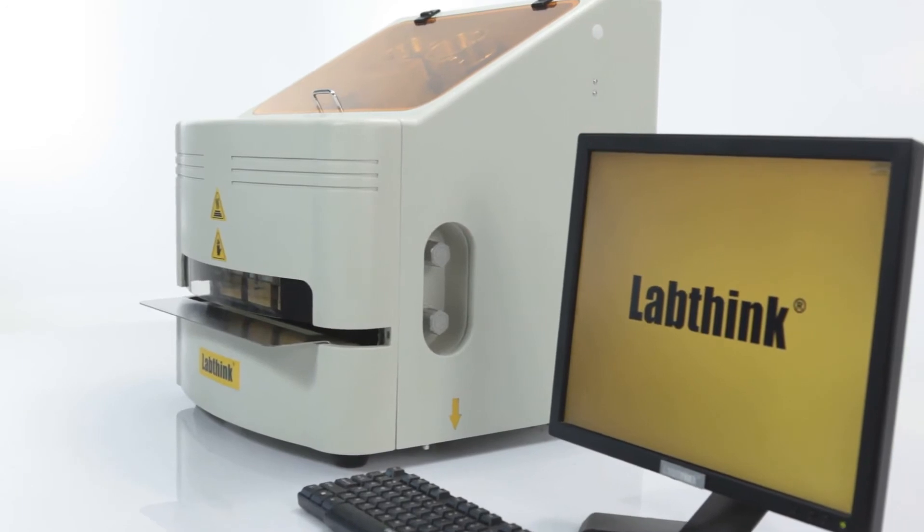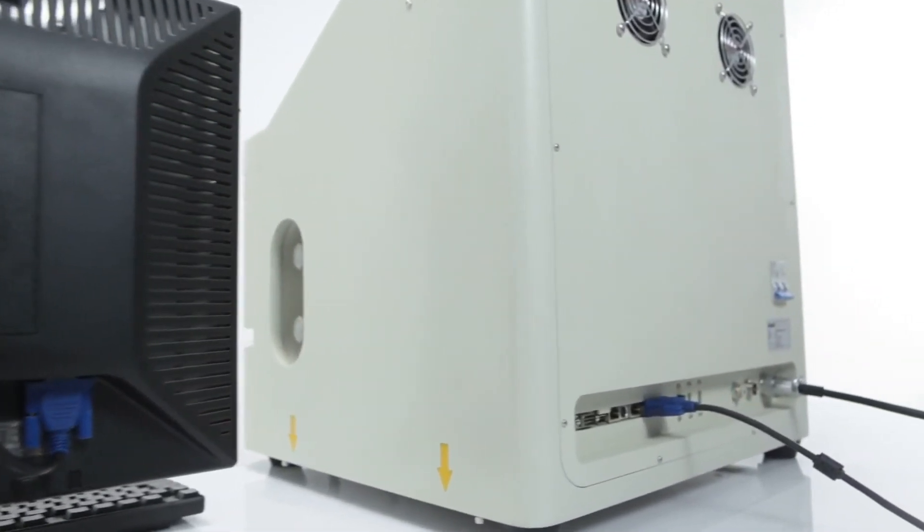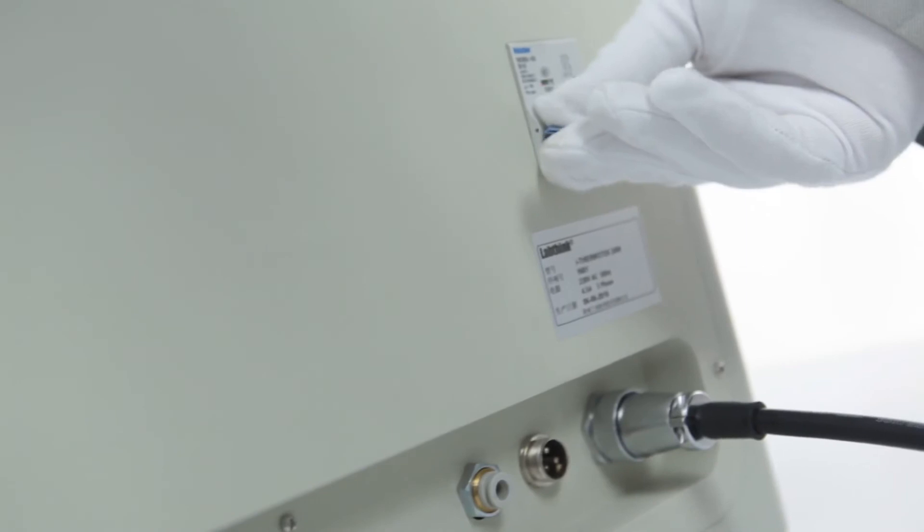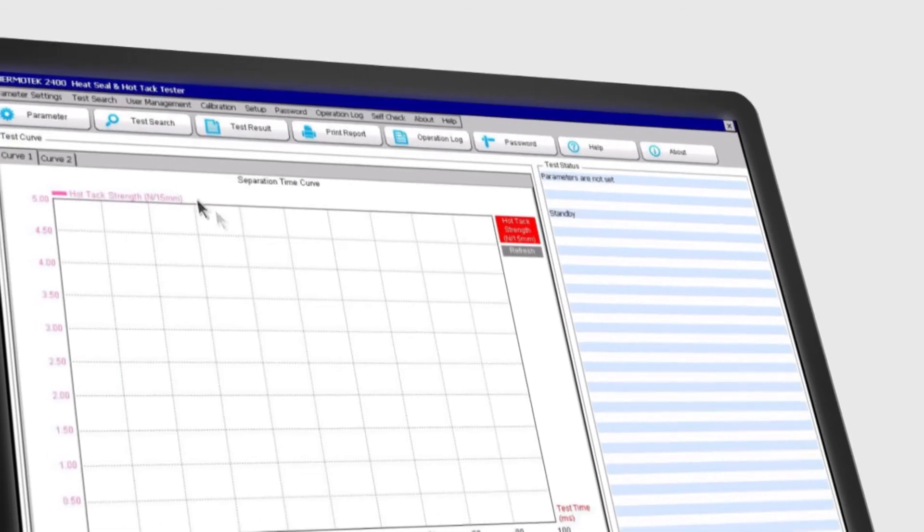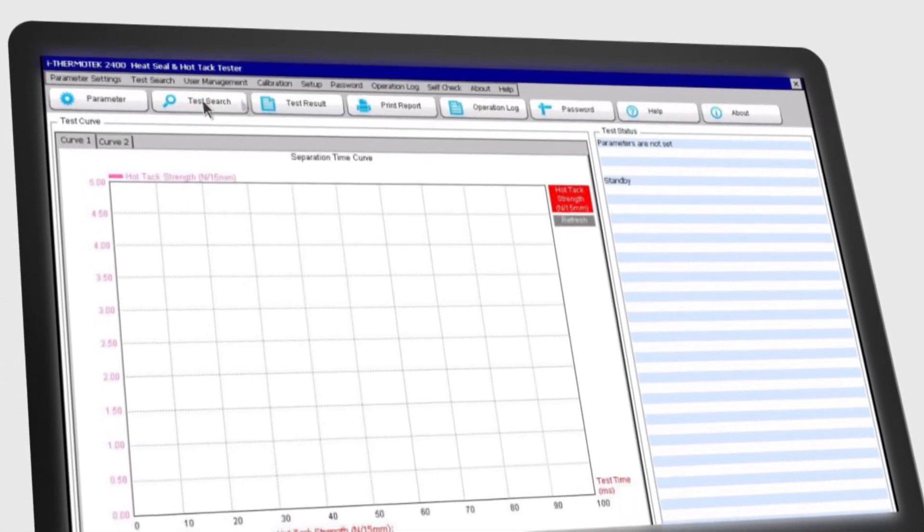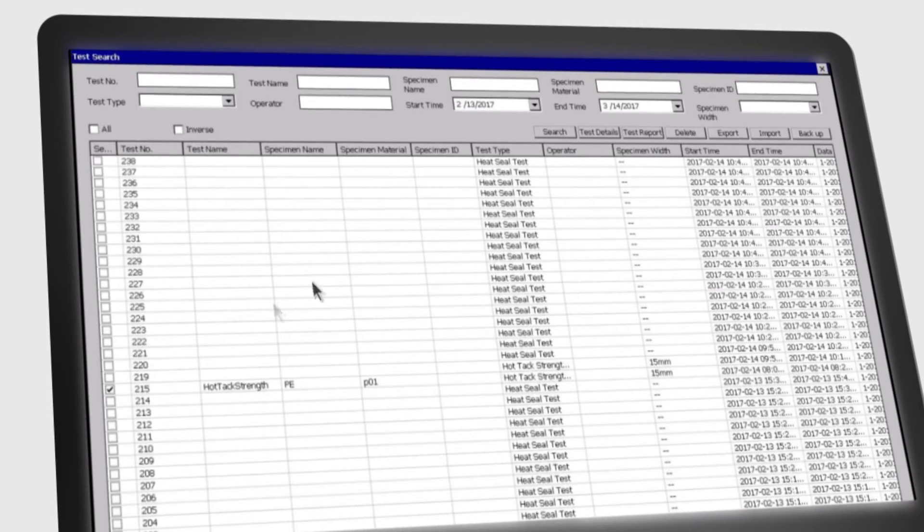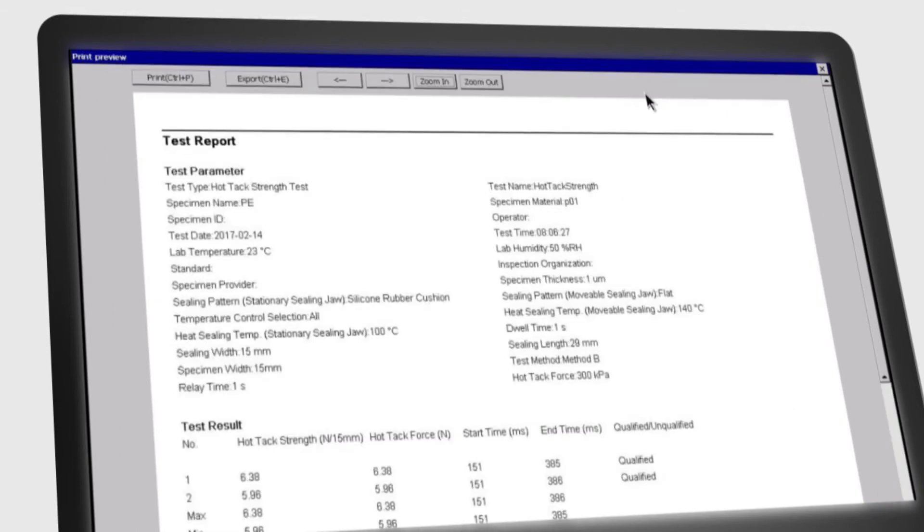i-Thermotech 2400 is embedded with computer control system which ensures the flexibility of instrument operation and improves the reliability of operation and data management. The instrument supports data storage in different formats as well as data inquiry, data compression, data analysis and printing that can facilitate users with data transfer and statistical analysis.